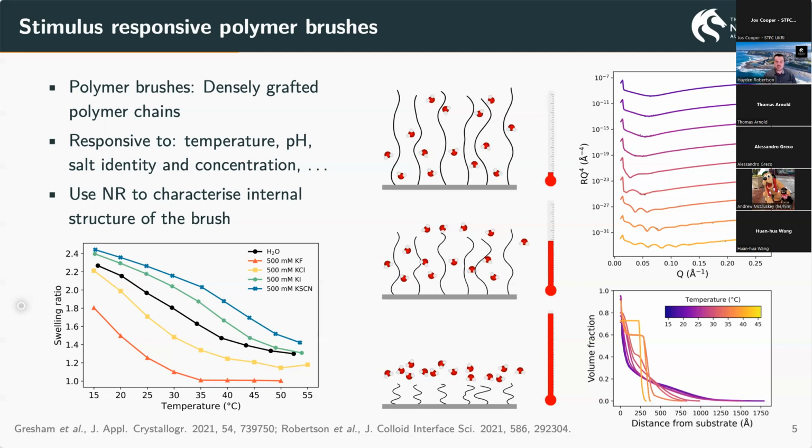So in doing all these types of preliminary experiments with an ellipsometer, we quickly acquire a lot of ellipsometry data, which when you're using some sort of proprietary software that doesn't allow the batch processing of data, can be quite time consuming. And I guess herein lies the reason that Refellips was born.